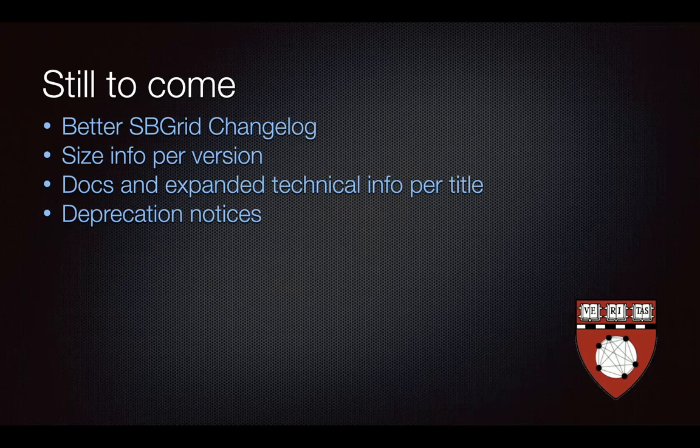This is particularly relevant for GPU accelerated applications like RELION, right? Where you've got 5 different CUDA builds, and you're trying to figure out which version is best for the card and the machine that you have. And so we have that information now. It's spotty. It's kind of spread around in a couple of different places. We plan to make a central source and make that visible right up front.